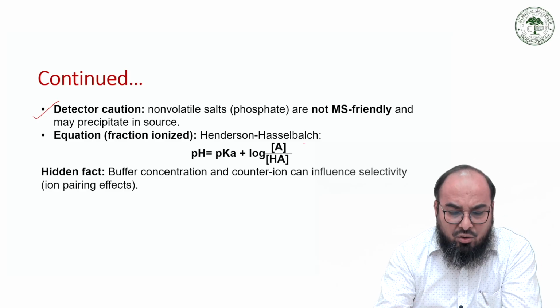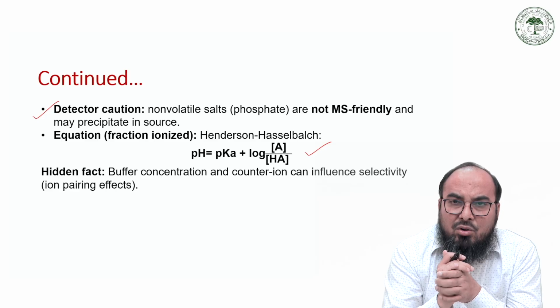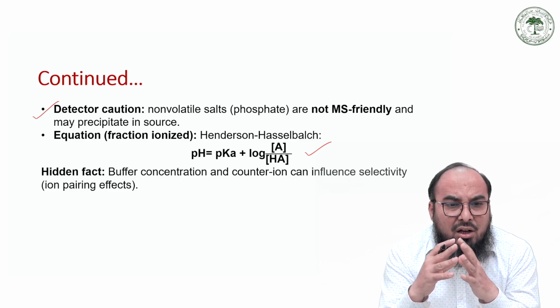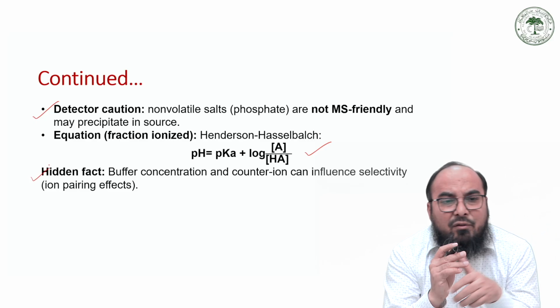Similarly, this is the well-known Henderson-Hasselbalch equation, which gives you an idea about the pH of the solution. And here, as I have said, you have to look for the common ion effect. Okay, so you have to choose the buffer very intelligently.